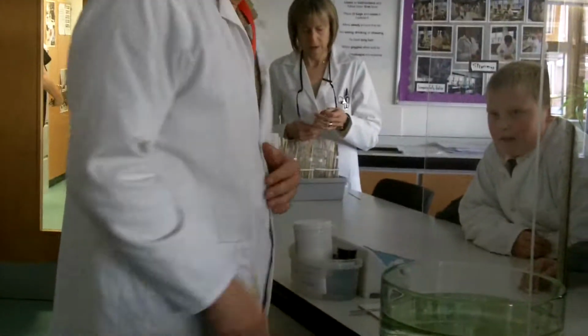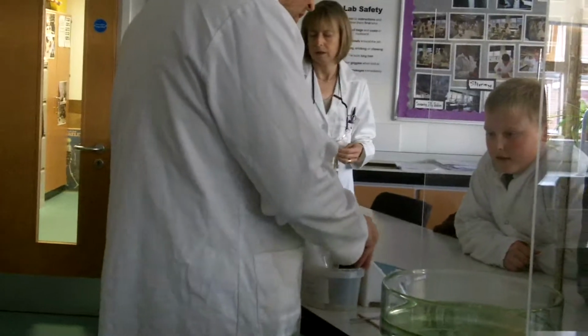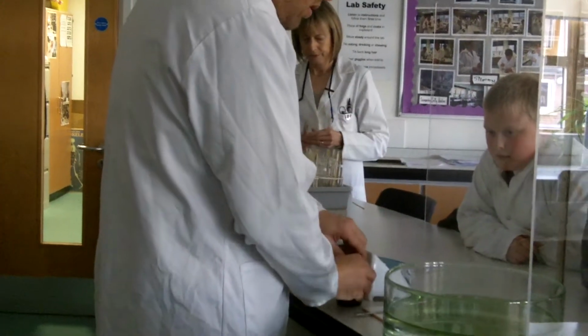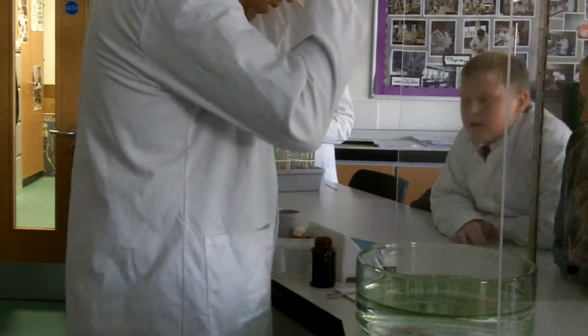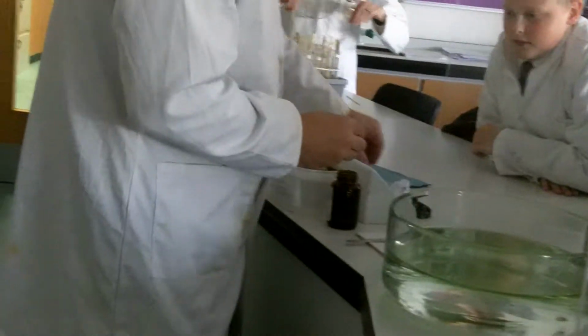Well, I'll start with lithium. Should I start with lithium? Yes, I will start with lithium. These are metals, they're all metals, and I'll just show you guys what they look like. They're so reactive, we have to store them in oil, like that. So there we are, this piece of lithium, covered in oil.